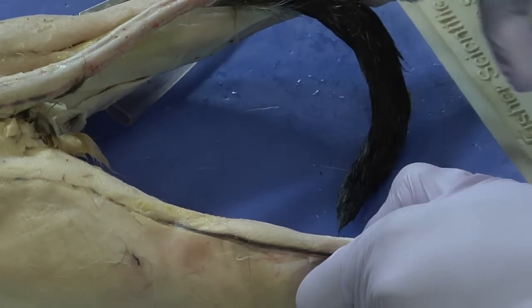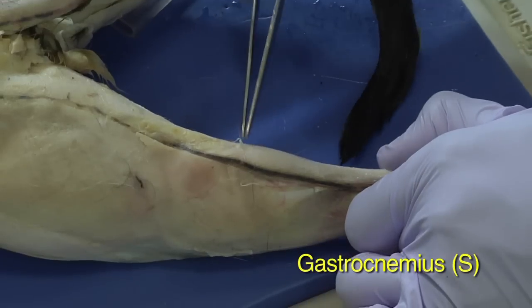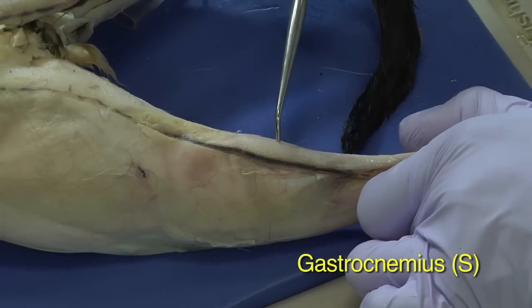...this muscle, which we call our calf muscle, is the gastrocnemius, and that's just this muscle right here. So it's the calf muscle.